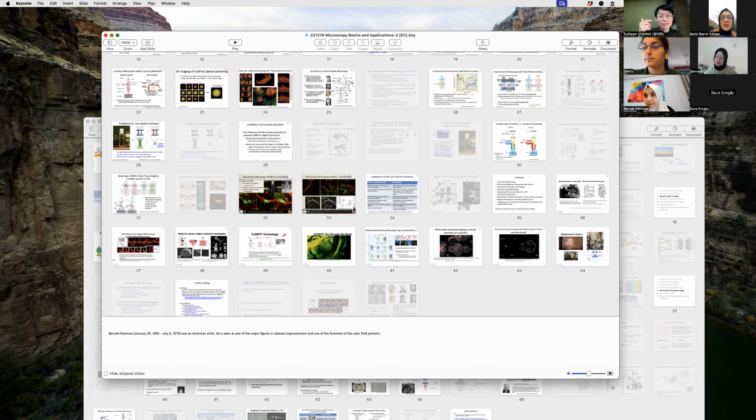But the fundamentals, why I started with a wave, the nature of wave, which is a bending, and we use that bending property by use of lens to collect scattered light into a point which will form an image. So likewise, electron is a particle, but in modern physics, it was discovered that these tiny particles also have their own wavelength, which is super tiny.